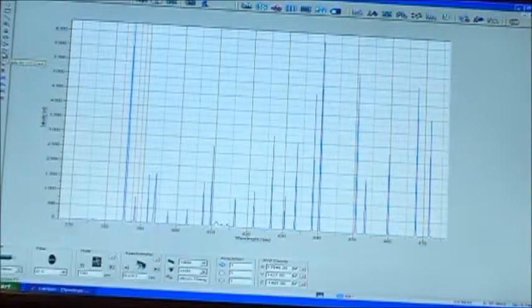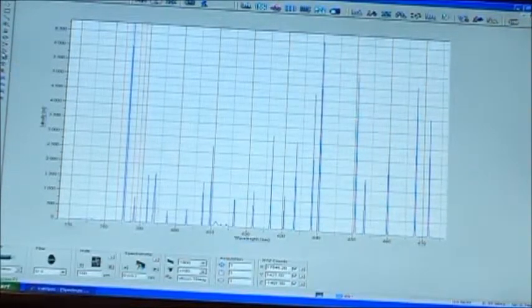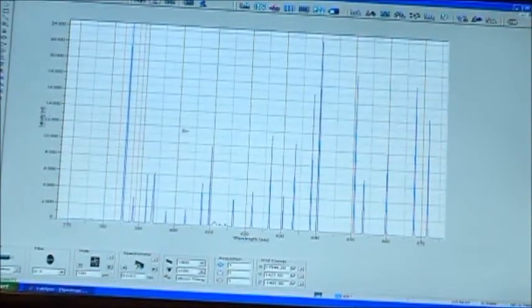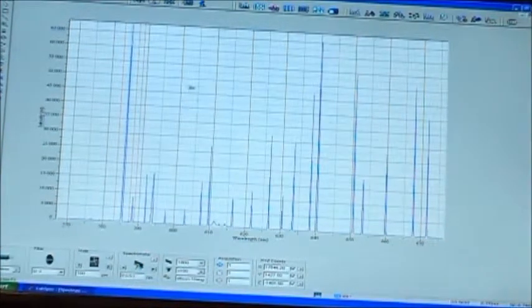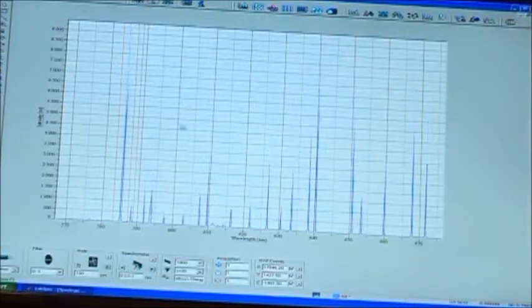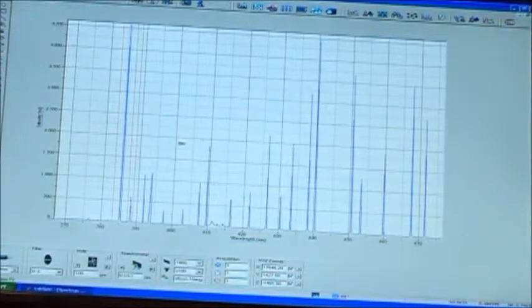Next below that is multiply by constant. So we click on that, click, hold, drag. If you slide up, you're multiplying all of your data points by a constant. If you click and hold and you drag down, you are starting to divide all of your data points by a constant.